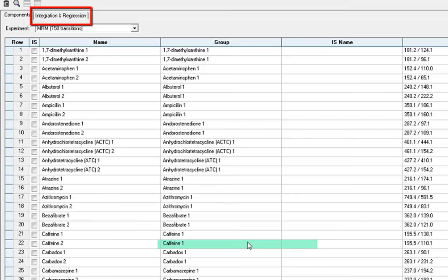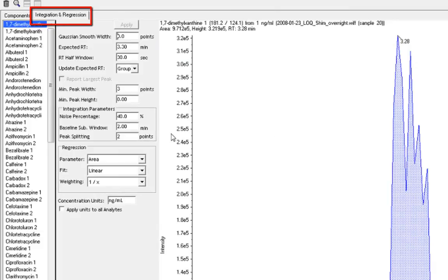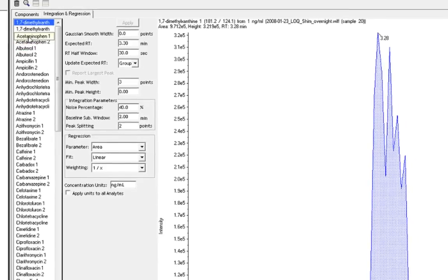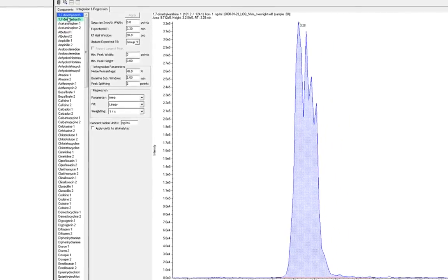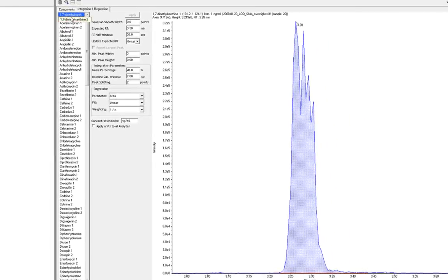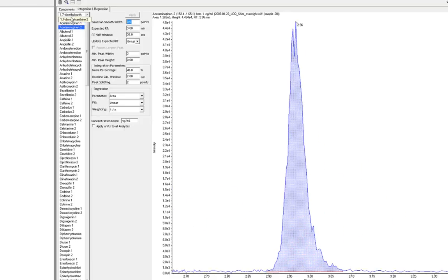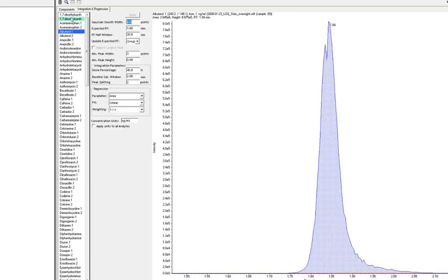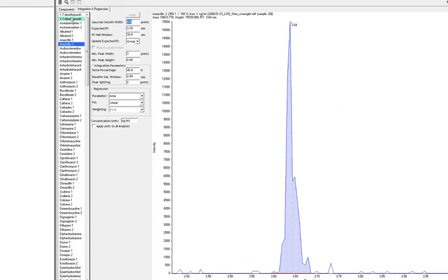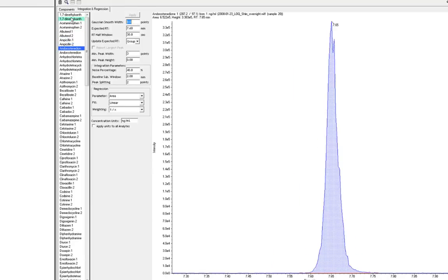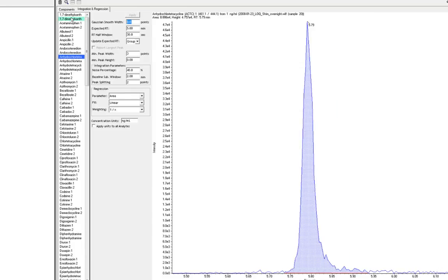Next, we can select the Integration and Regression tab and review the integration and regression parameters for each MRM transition. MultiQuant does an excellent job of integrating chromatographic peaks and often requires very little manual integration adjustments. You can use the down arrow to scroll through to review each analyte.